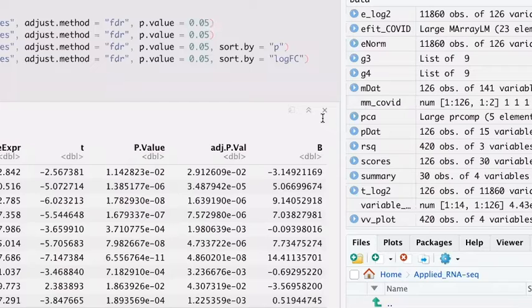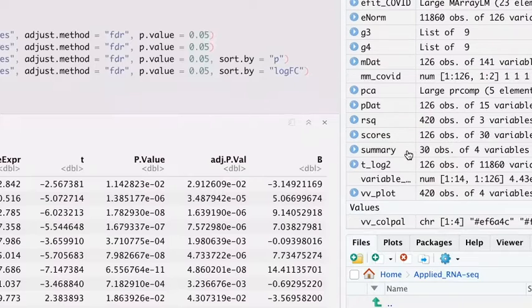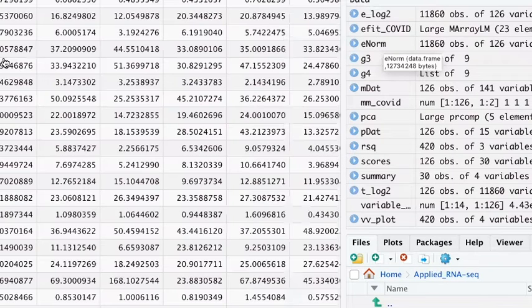Pull those rows, I can see that. Active data. Let's see. Oh, I haven't loaded an EDAT. I'll check that later.